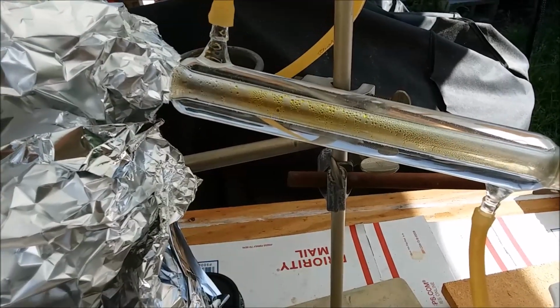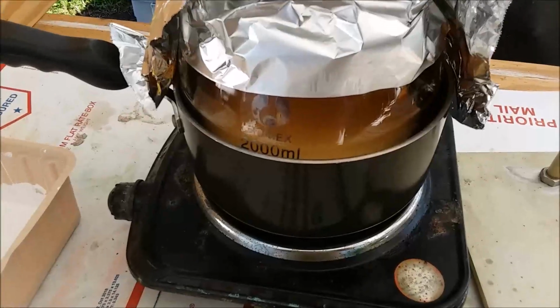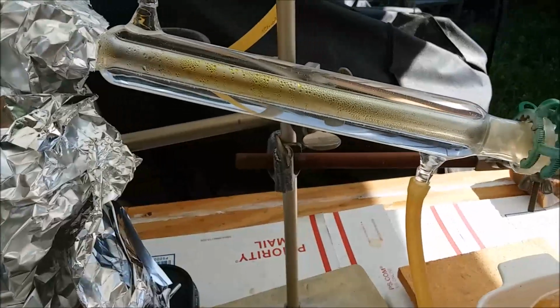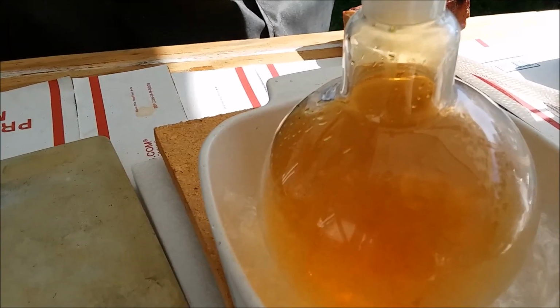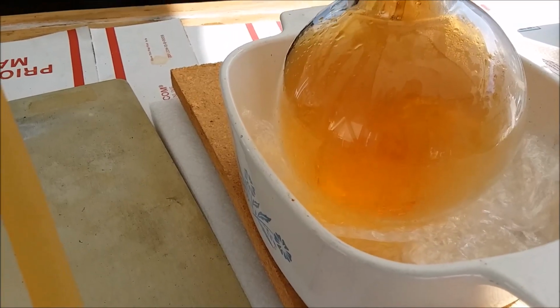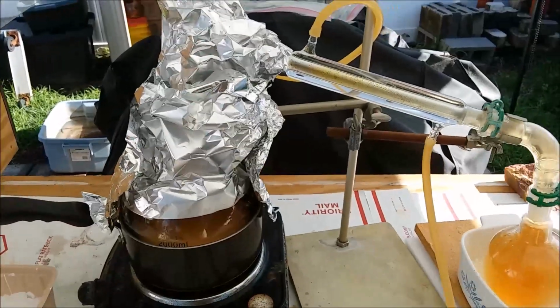Well, I don't know if it's the larger volume of reactants in the flask or the larger surface area of the flask to absorb heat from the oil bath, but this reaction is just chugging along at an amazing rate. Look at how fast those drops are coming down. So this is great. This is really cooking along. Couldn't be much happier with this.